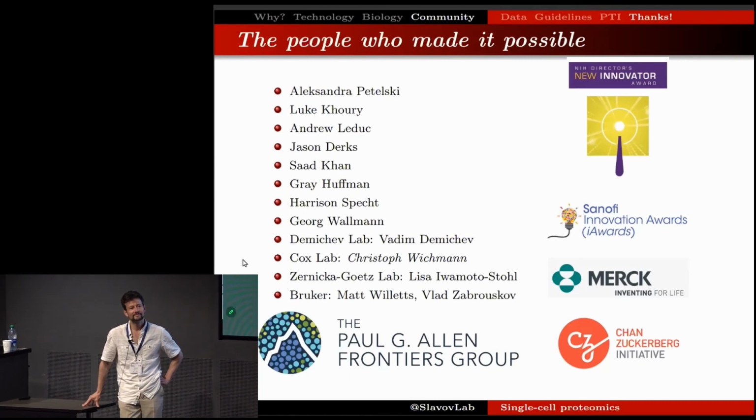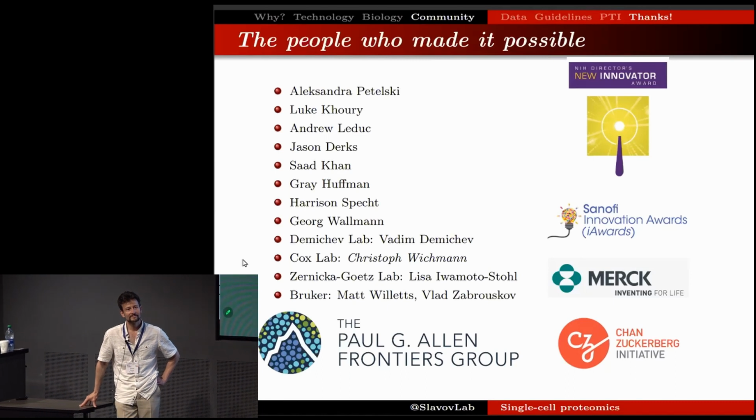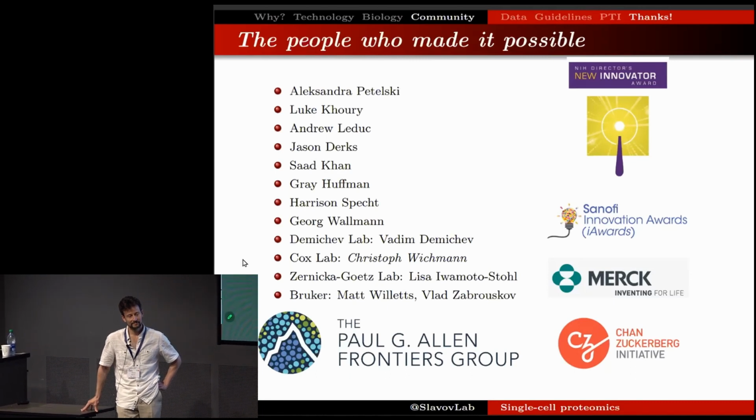Thank you, Nikolai, for the very nice talk. In the first strategy of prioritizing the proteins into different levels of priority, what were the criteria? Did you filter out the ones that are most likely to be differentially post-translationally modified, or, like, was abundance of the peptides a factor?